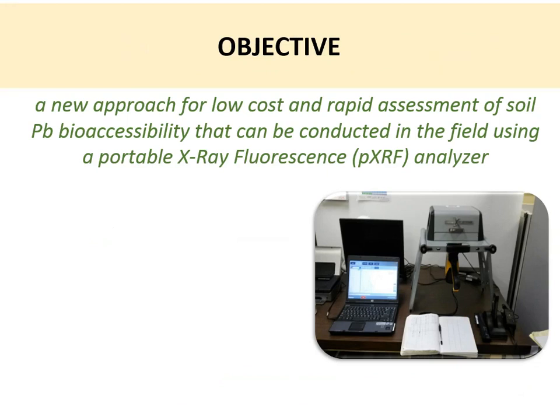The objective of our study is to develop a new approach for low-cost and rapid assessment of soil lead bioaccessibility that can be conducted in the field using a portable X-ray fluorescence analyzer, and you can see how it looks. This is the XRF, which is kind of flipped, because in this part you put the sample inside of the box, a liquid sample or a solid sample, and there is a computer attached to it, so you can get the data right away.